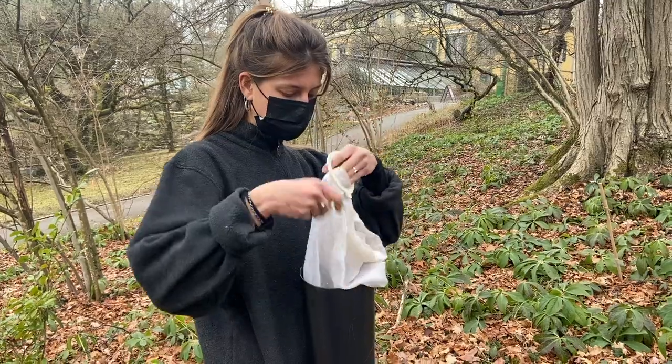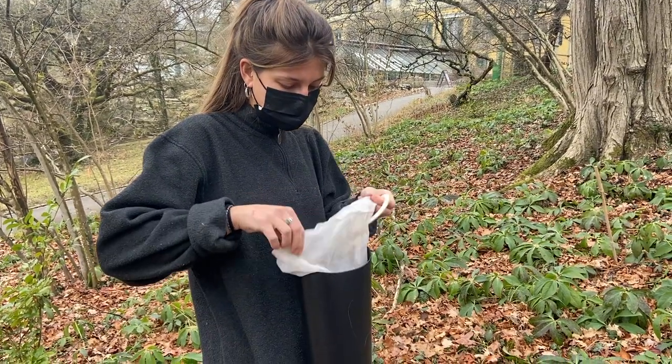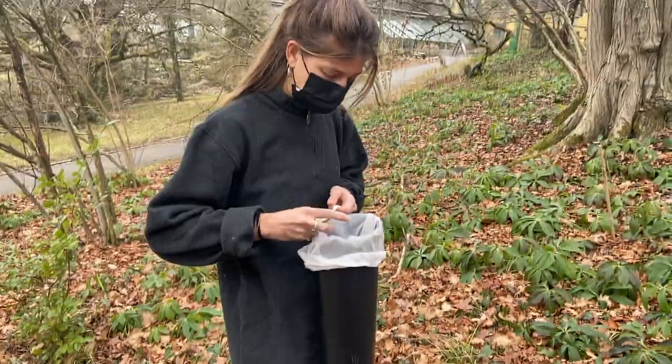Insert the fine mesh bag into the nozzle of the leaf blower and seal it securely with the rubber band.